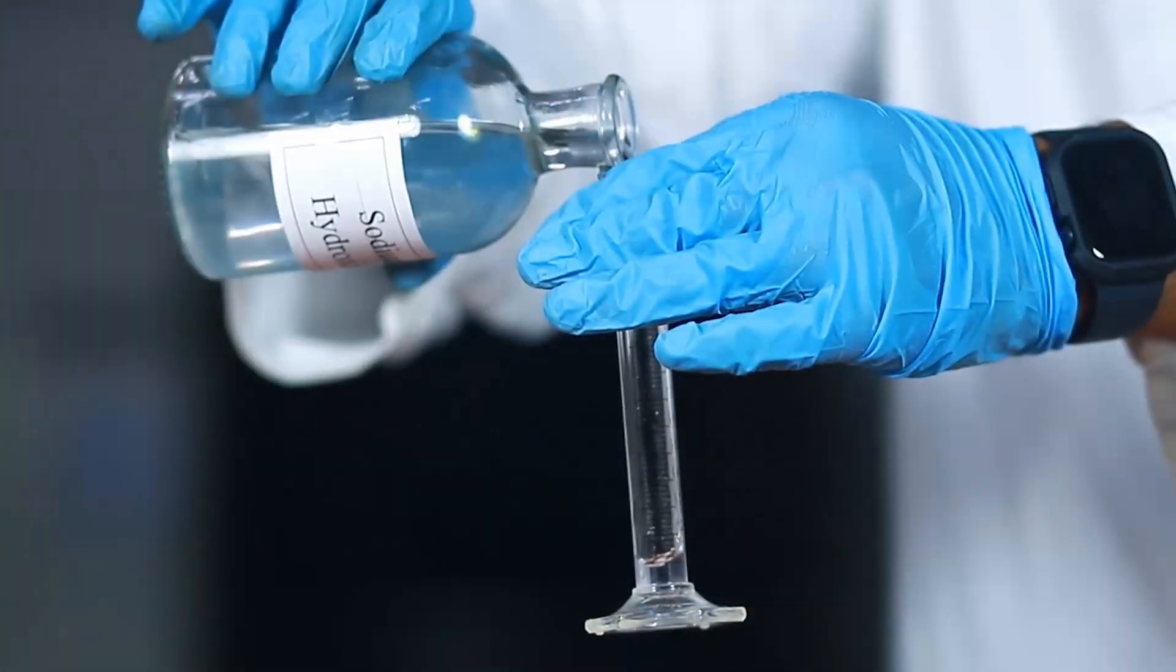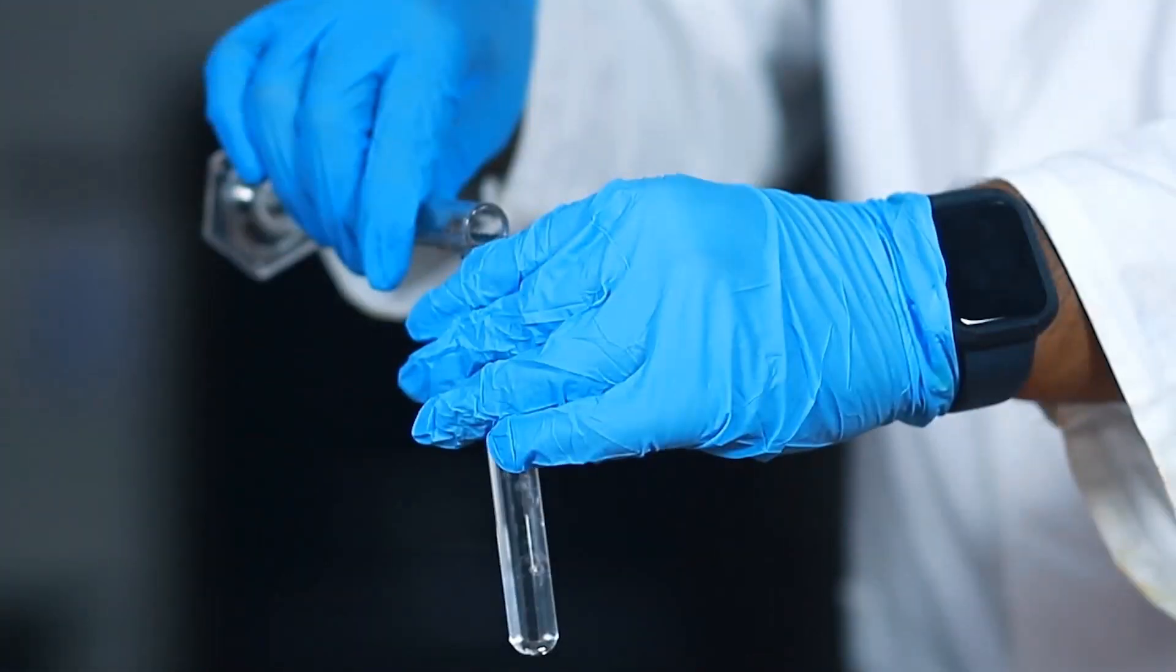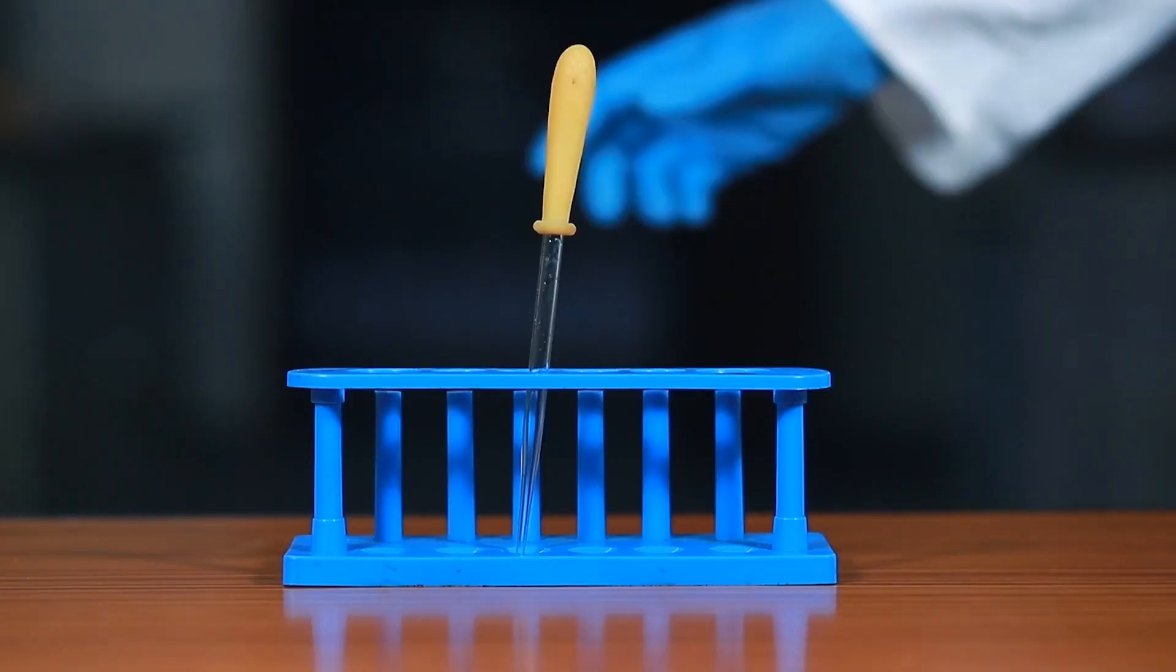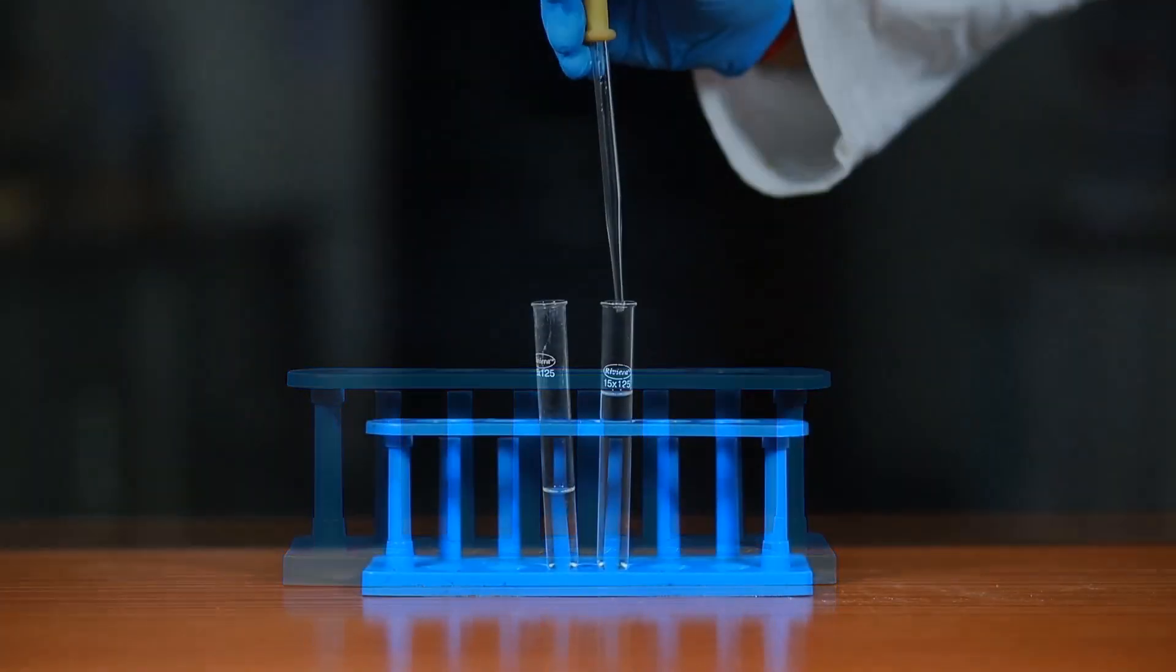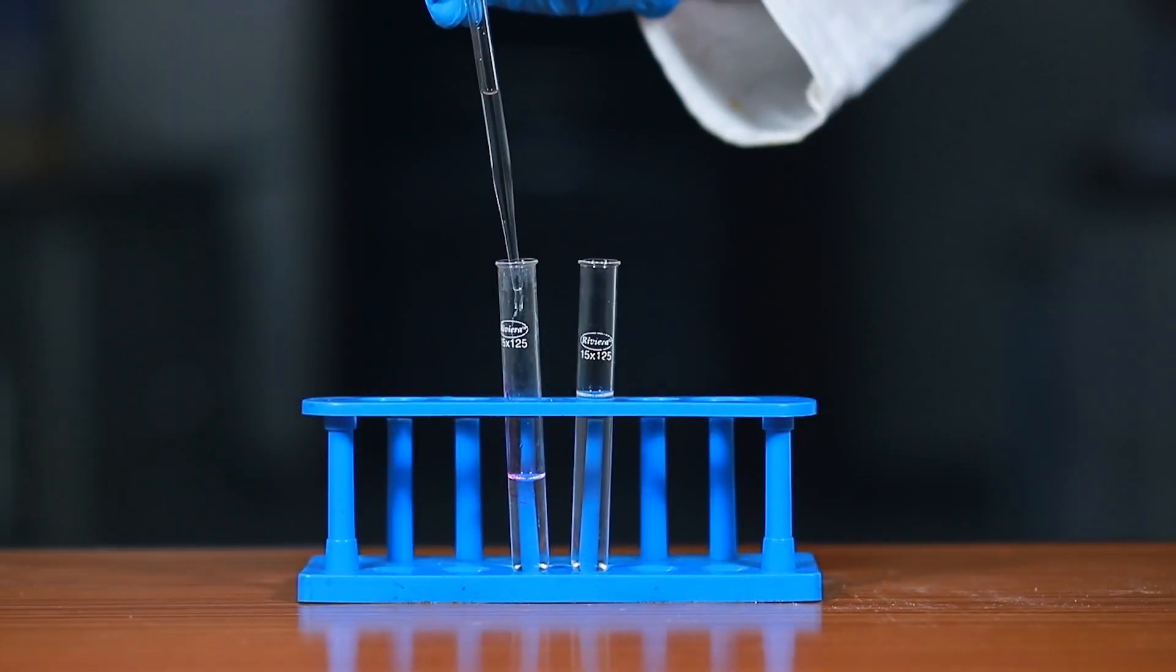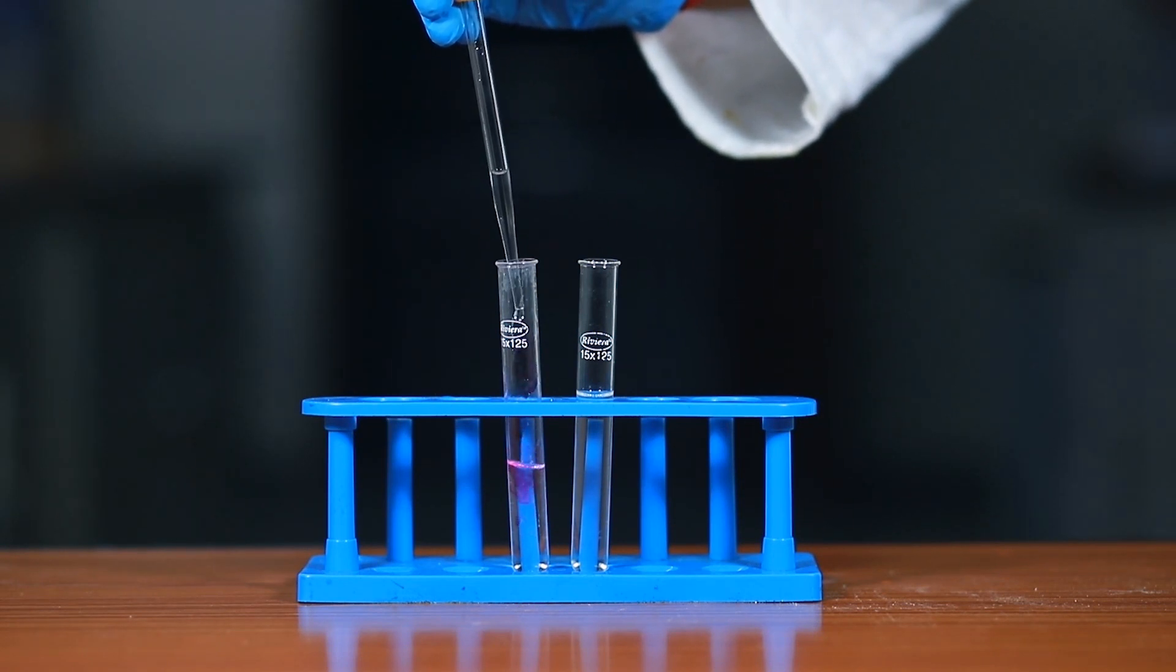Now, take about 10 ml of dilute sodium hydroxide solution in another test tube. Take out sodium hydroxide solution with the help of a dropper and start adding the solution drop-wise into the test tube containing hydrochloric acid till a change in color is observed.